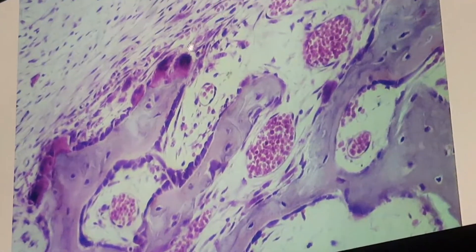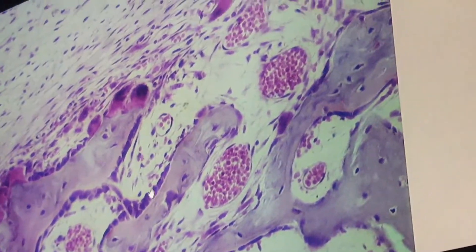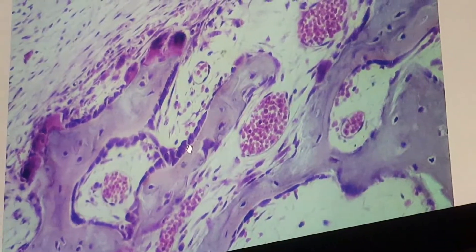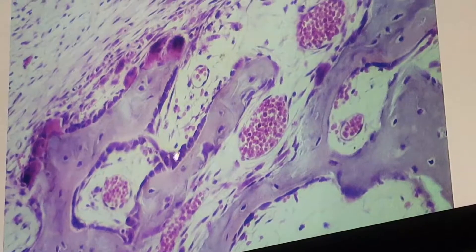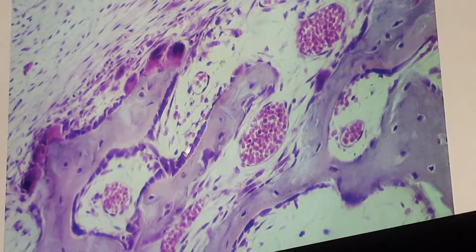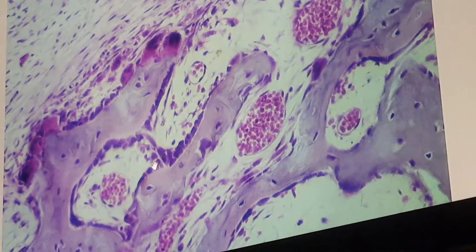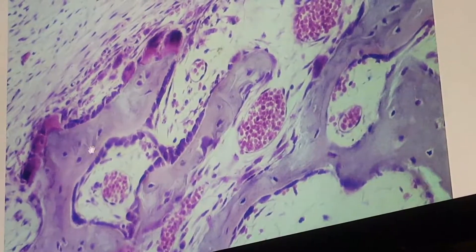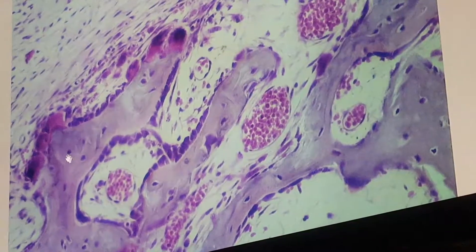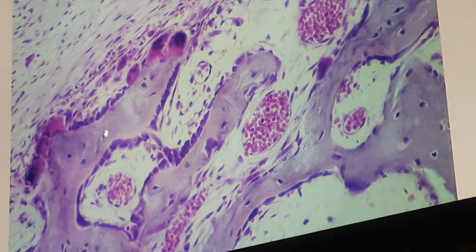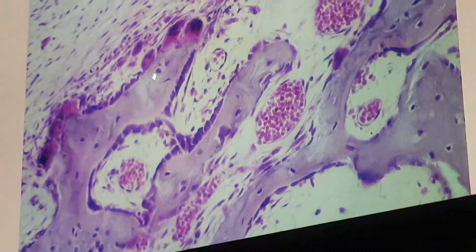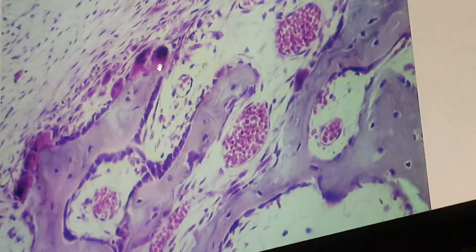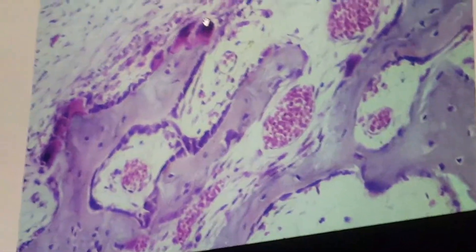From this slide we can see three types of cells: on the surface of the bone is the osteoblast, found within the matrix are osteocytes, and the giant multinucleated cell is the osteoclast.